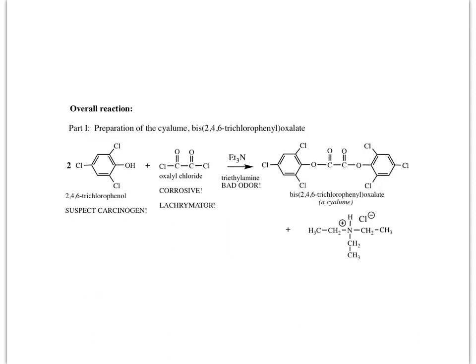So the molecule we're going to synthesize is this bis 2,4,6 trichlorophenyl. So bis differs from di in that bis means the two groups are connected to different places. We have two large groups connected in different places, so it's a bis. If this is 1, there's a chloro on 2, 4, and 6 of each ring. So trichlorophenyl.